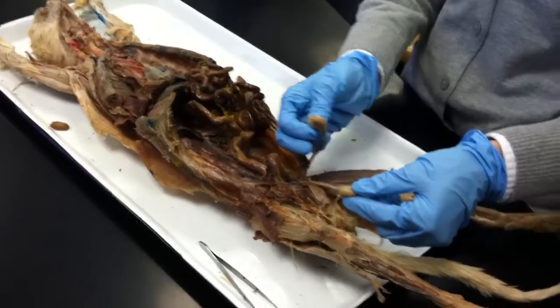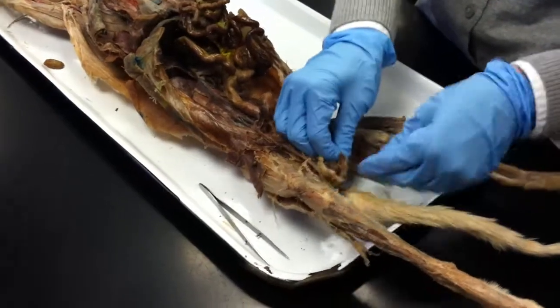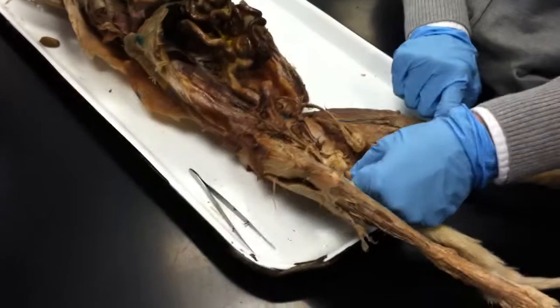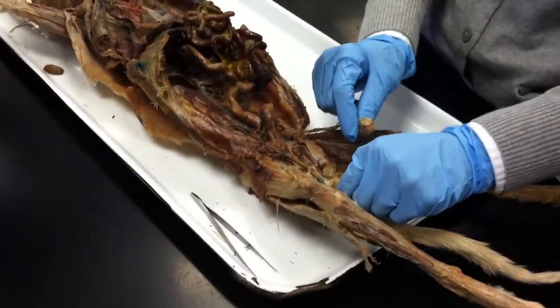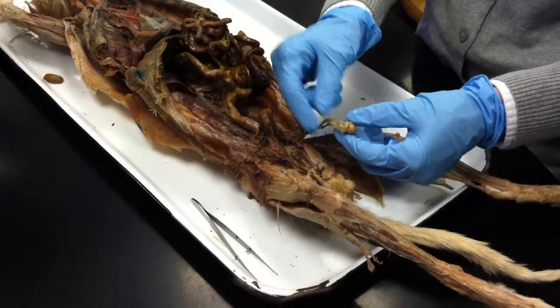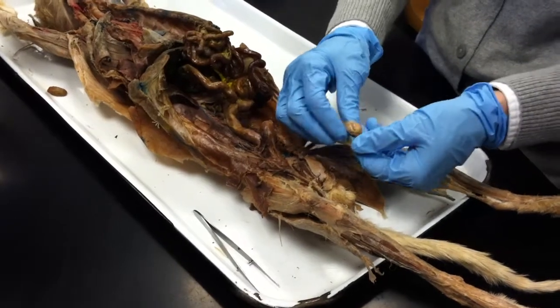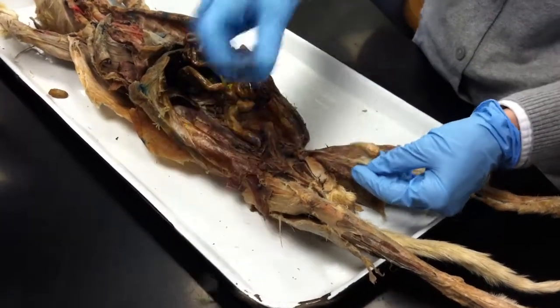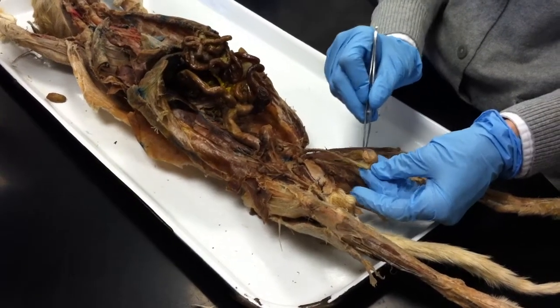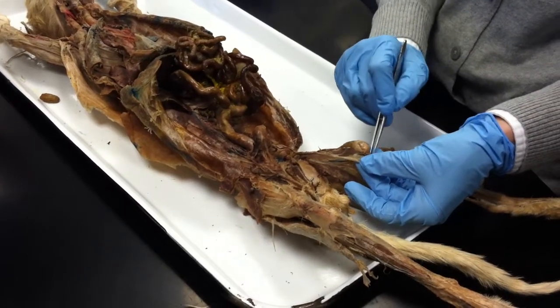So, these are clearly the testicles. They reside usually in the fur-covered sac, which is the scrotum down here. Okay? Testicles. The testicle is covered with a membrane. That's the vaginalis. And if we look at the testis itself, here's the testis, this round part, right? This part here is kind of like a little C. This is the epididymis.